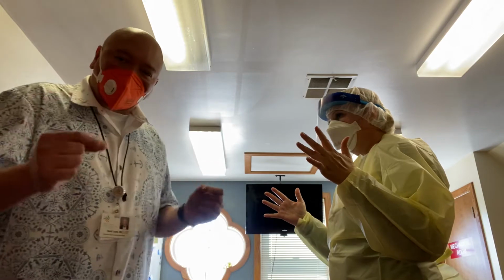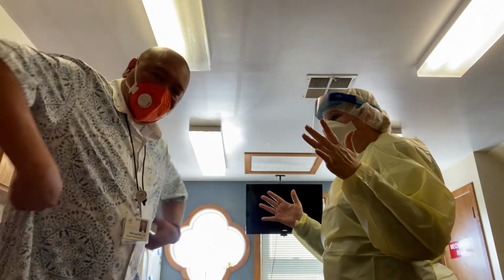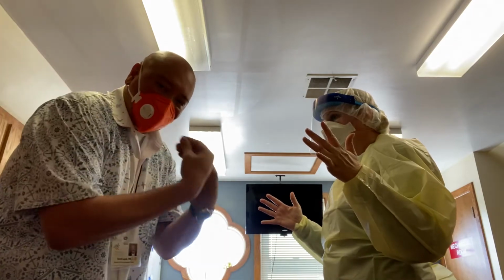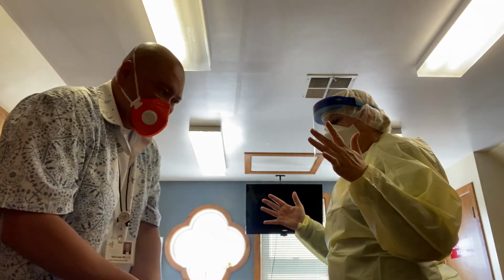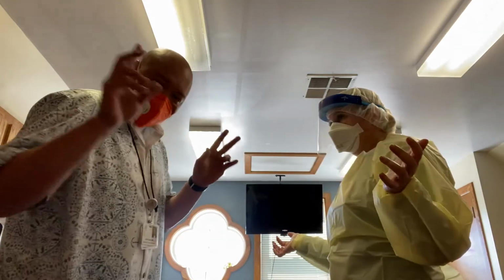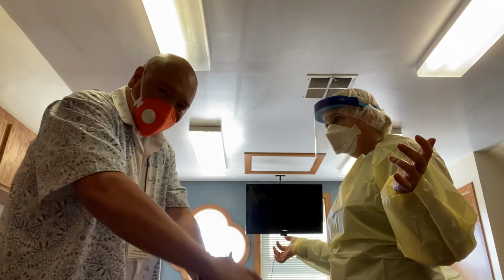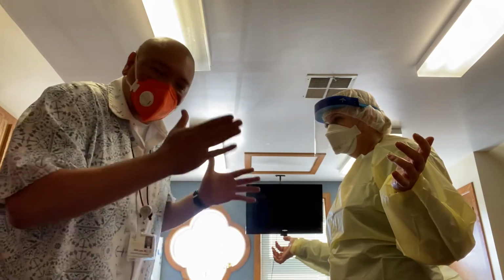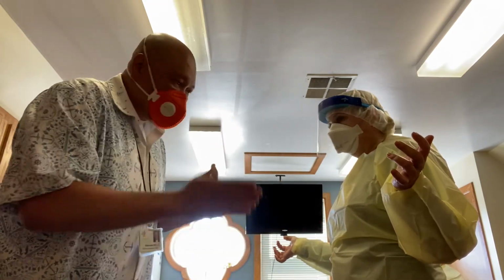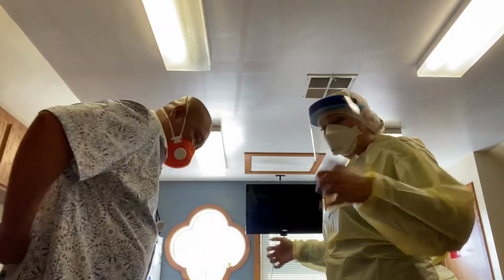Now, the process of removing the gowns is to make sure the back is untied, pull it out, and roll it inward into a ball without touching the front. Technically, this front area and her arms have been exposed and contaminated, so you need to be careful in taking it off. So take the back off.